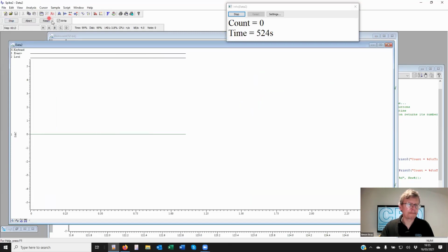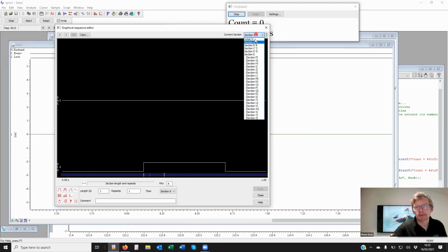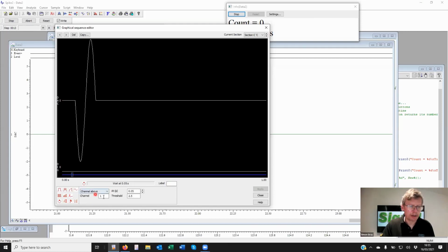We start. Remember, the initial section is already run, and any of these with the keys set A, B, C, and D need to be executed by us. So it's C that we're going to detect the waveform. So channel 1, and then once that waveform is achieved 2.5 volts, then the sinusoid will go out.